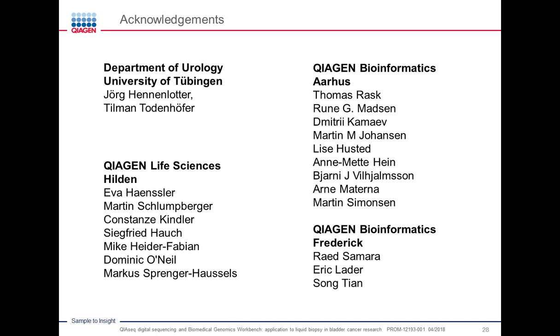Dr. Lescai, our next question is, what are the factors that might influence the detection in plasma of tumor mutations? This is, I think, a very important question. Thanks for asking it, because I think that the liquid biopsy has really a great potential to making it easier to detect the mutations in the tumor, and also, very importantly, to manage the follow-up of, for example, residual disease that is present after the tumor has been treated.